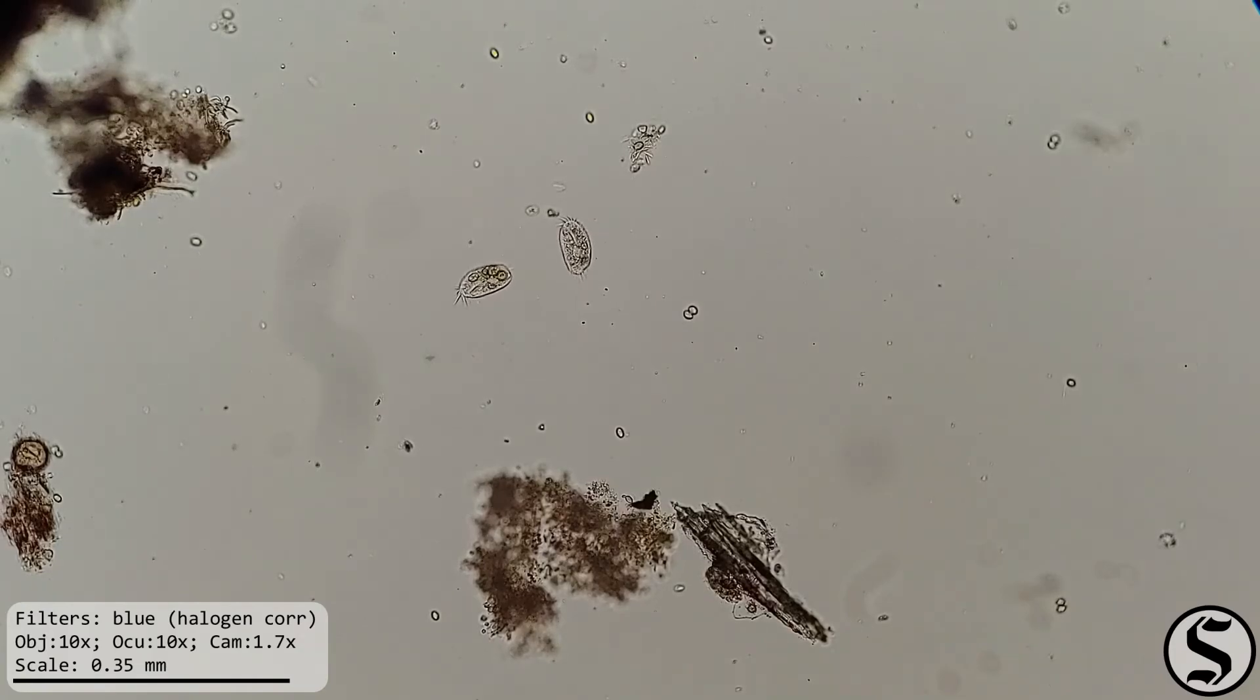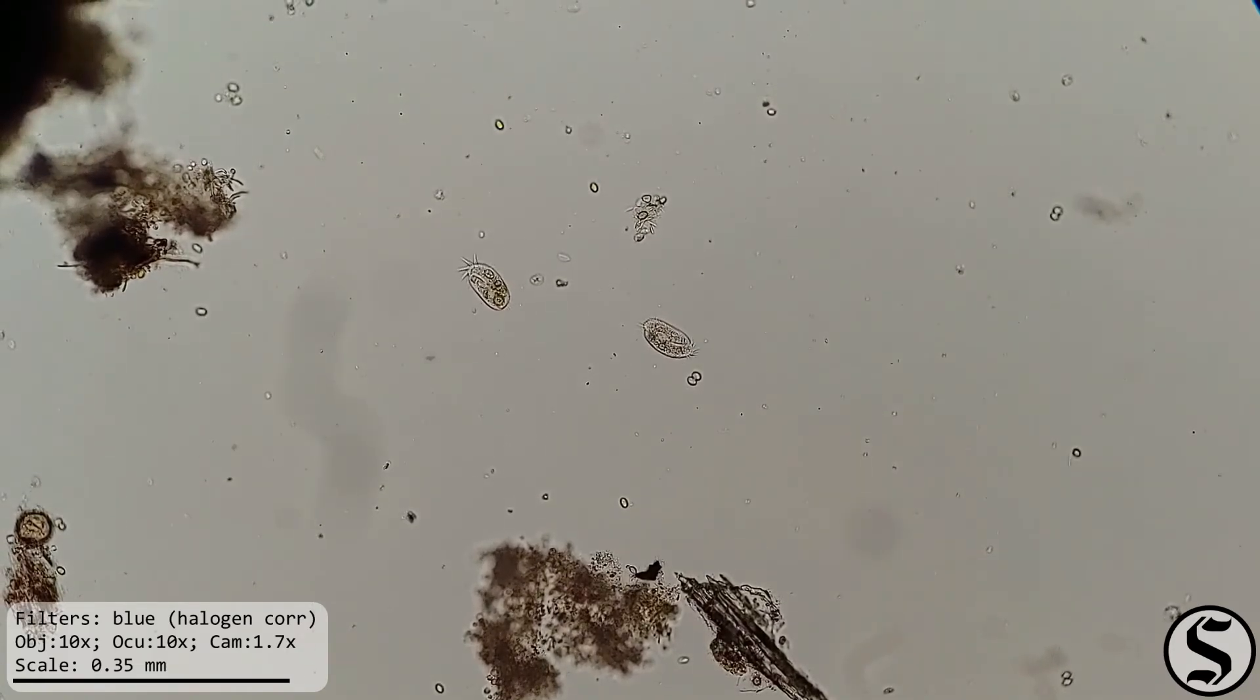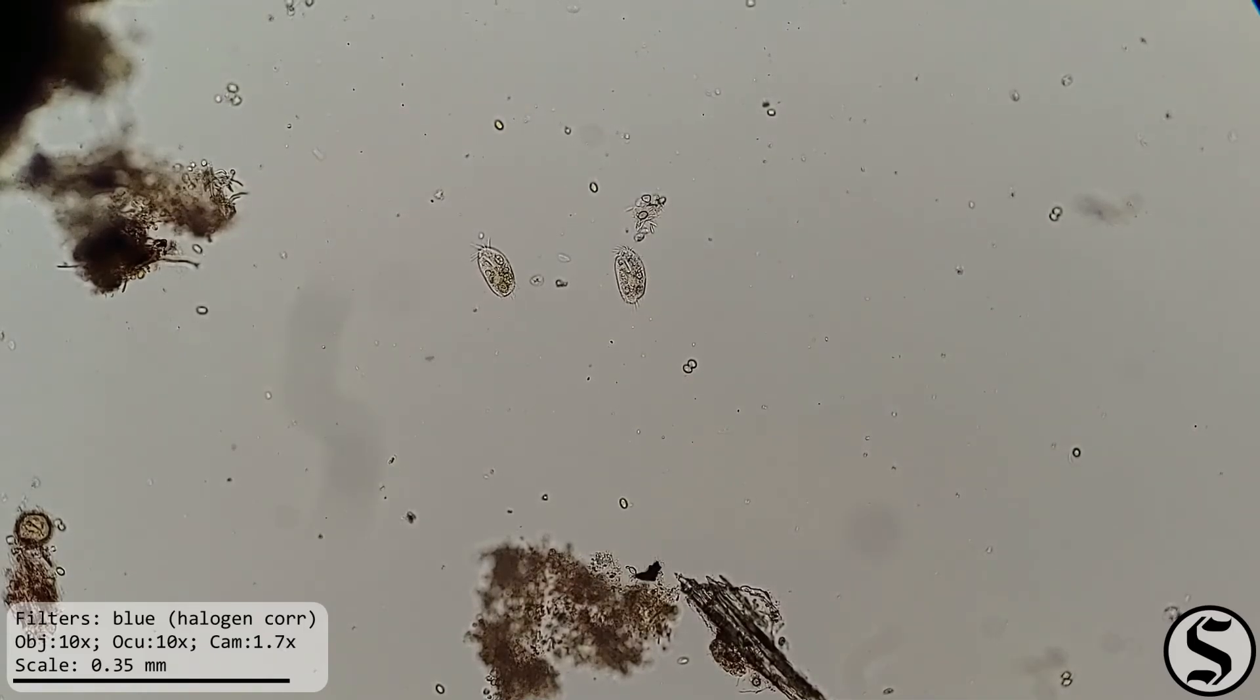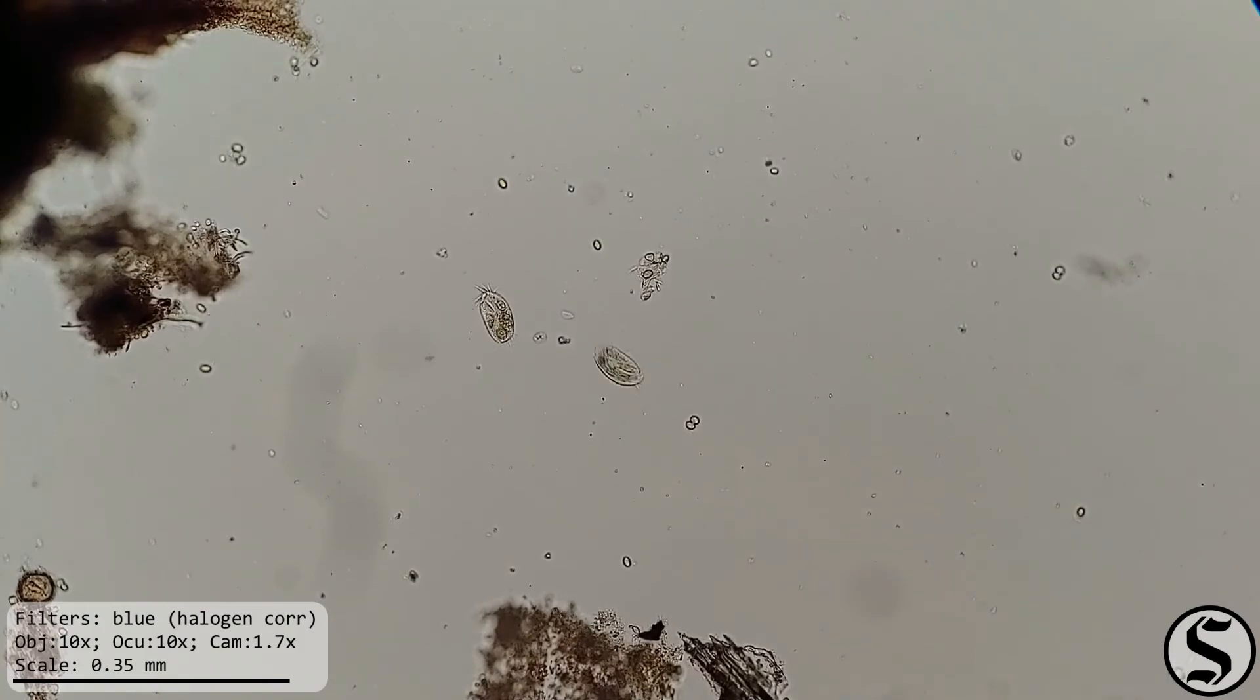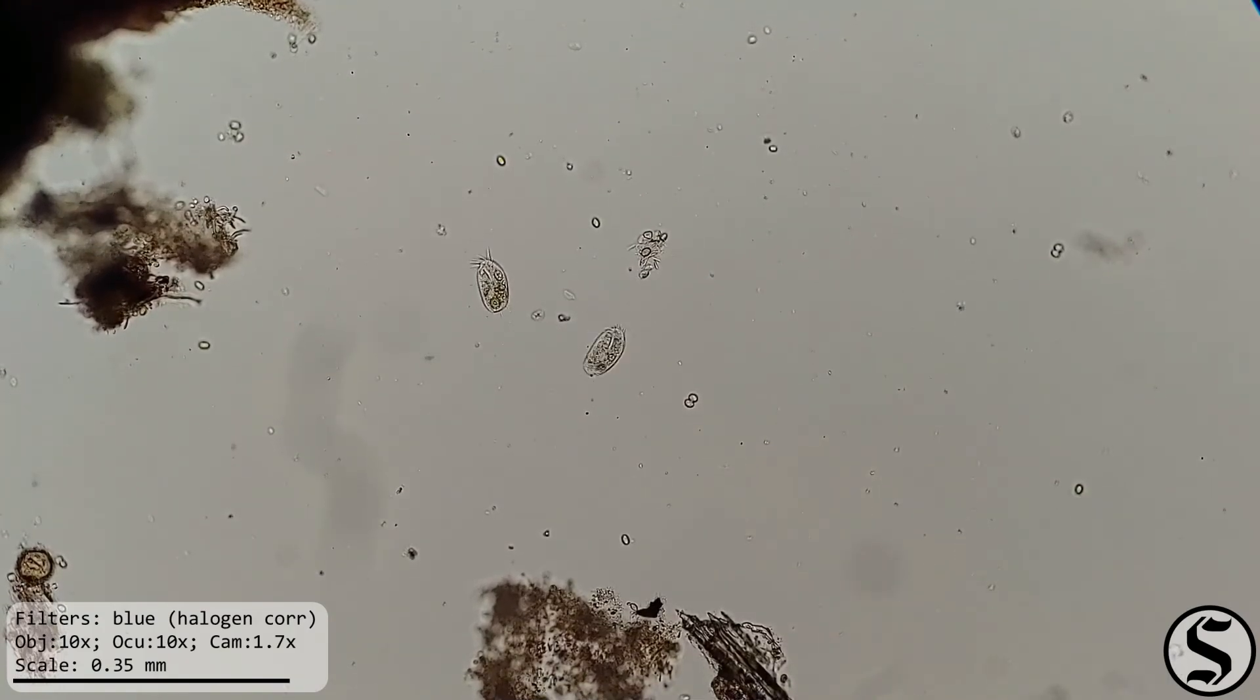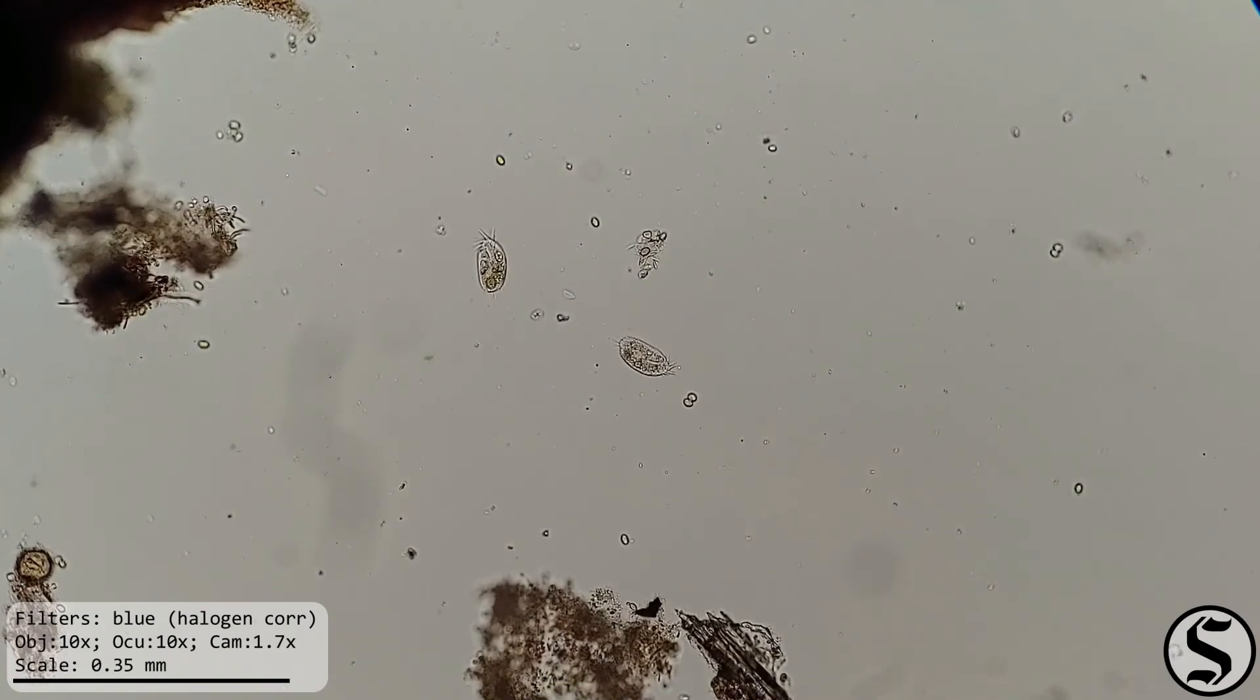Oh, there they go! Awesome. Well, that's the first cell division I've witnessed. It took about 14 minutes of observation, but once I recognized what was happening, I didn't want to miss it because that's just too exciting.